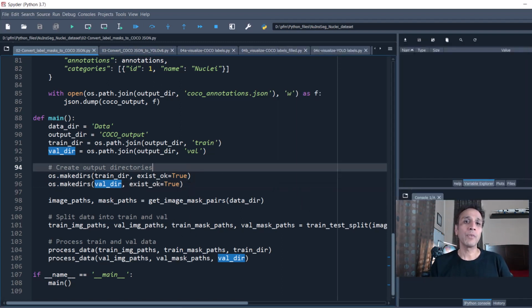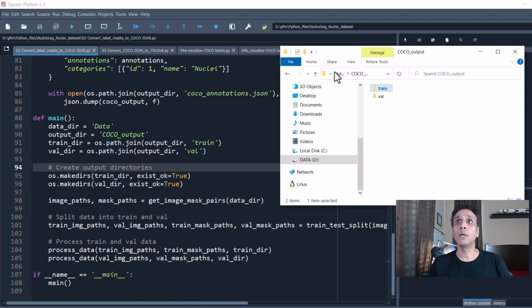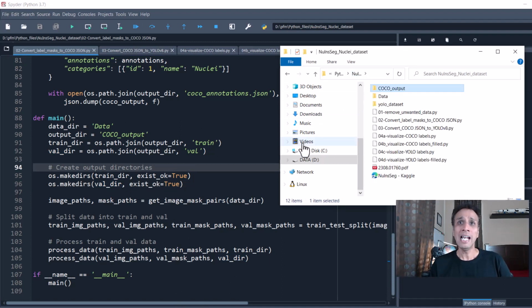So, okay, now going back to track. Now we have COCO annotations ready. I also want to show you in a single video. I don't want to make another video and make you wait two more weeks just for YOLO, which is ridiculous. So while we are doing this, let's also train a YOLO version 8 in case you are a YOLO fan. And for that, we need annotations in the text format, which is what the YOLO dataset expects. So the next part is exactly that.